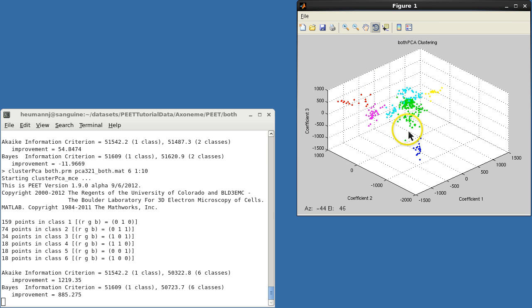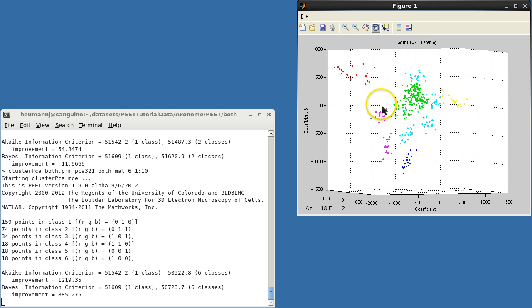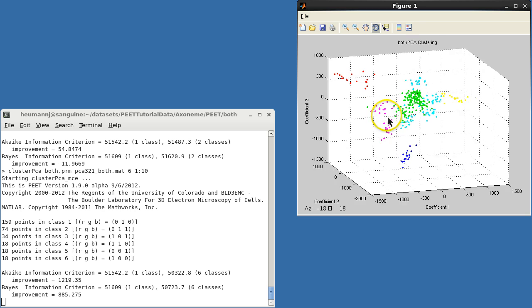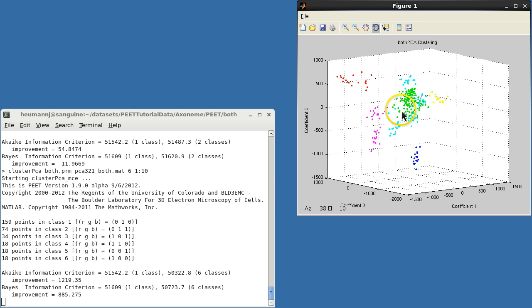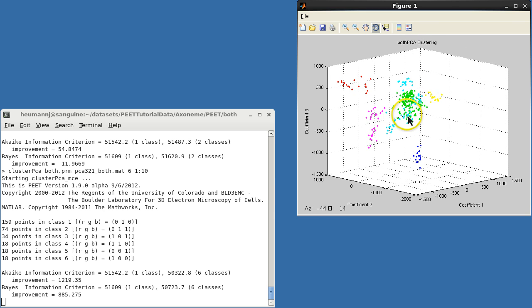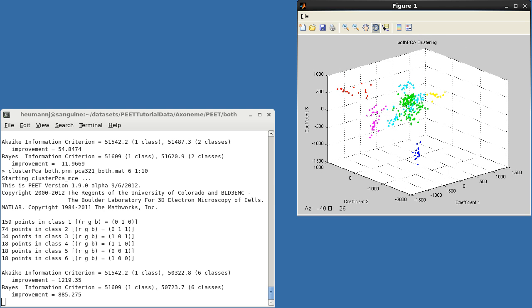With 3D graphs, we can also grab the rotate tool and see that the various classes are indeed well separated. In fact, it appears that even more subclasses may be present, but we have too few data to split things more finely. So, let's look at some of the output files created by clustering.